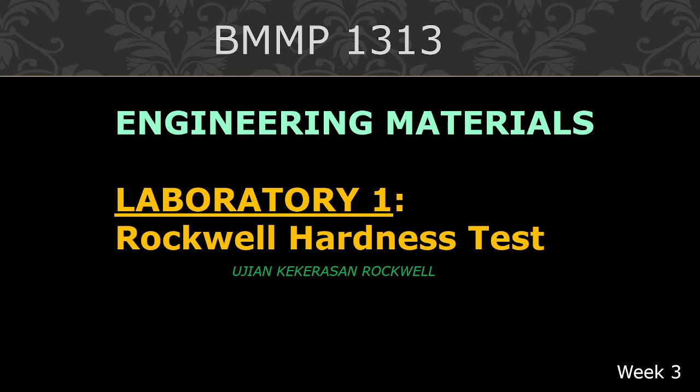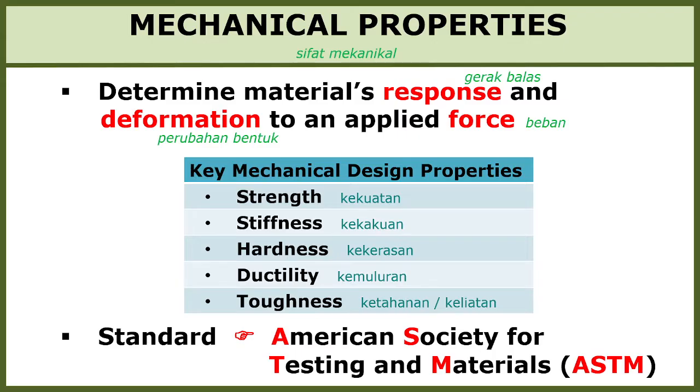Short briefing on our first laboratory, Rockwell Hardness Test. There are several mechanical properties of material. Some important mechanical properties of material are strength, stiffness, hardness, ductility and toughness. To get these properties, we need to do tests for each material.